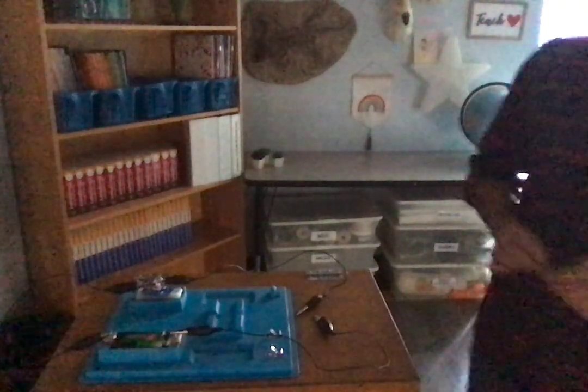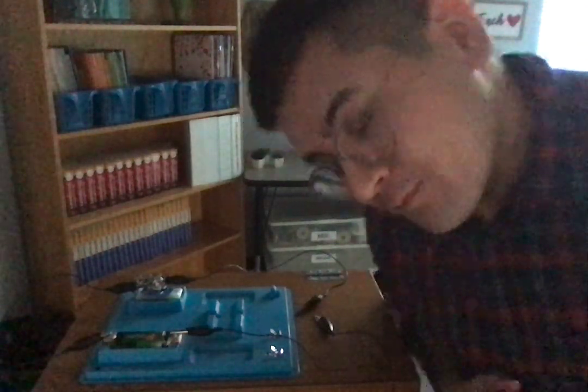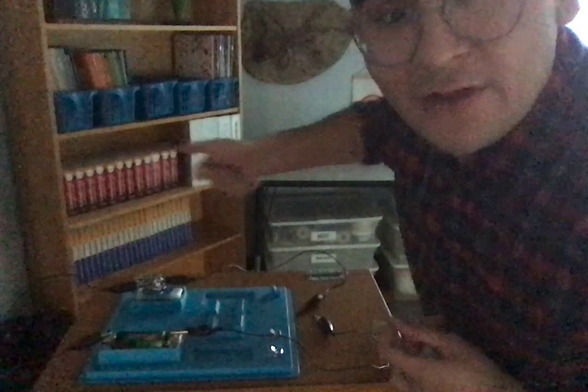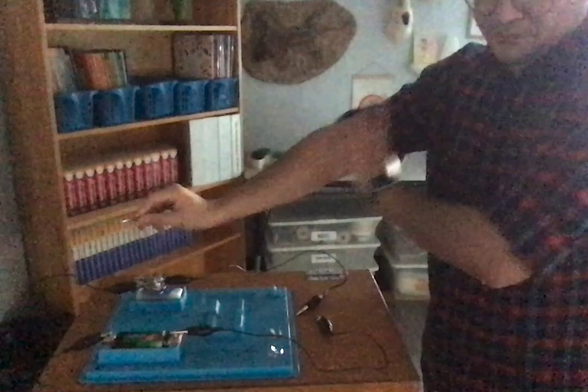Next material we're going to use is also a metal. This metal is called iron. Can you say that with me? Iron. Not like a plancha, the stuff that your mom irons with. Not that. No. Iron. Right here. Iron nail. It's metal. It's used in a lot of buildings. You can hear it. It's pretty hard.